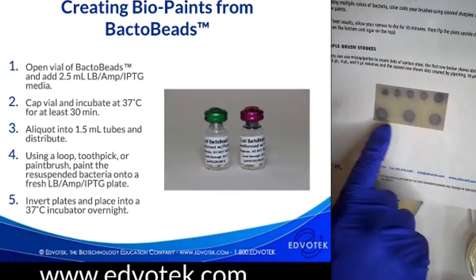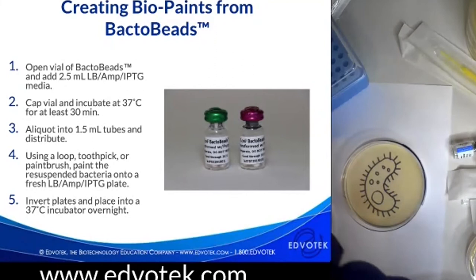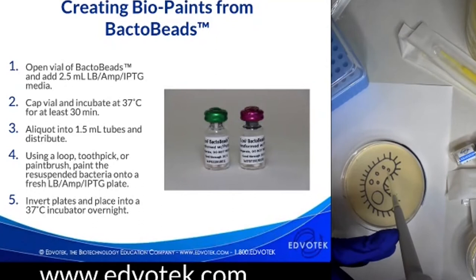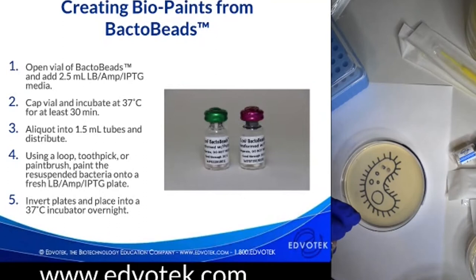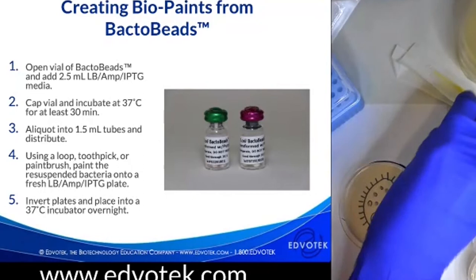So I got my pipette here, and I'm going to make some 5 microliter dots here to put, let's call them plasmids or whatever, onto my little critter here. And that is as difficult as it gets. This is something that you want to try, you want to start, and this is a piece of artwork that's done.